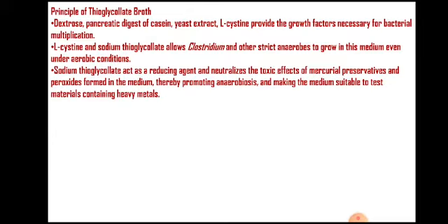Sodium thioglycolate acts as a reducing agent and also neutralizes the toxic effects of heavy metals if they are present in the pharmaceutical product, like preservatives. So the toxic effect of mercurial preservatives is neutralized. It also neutralizes the peroxides which are formed by microorganisms in the broth.